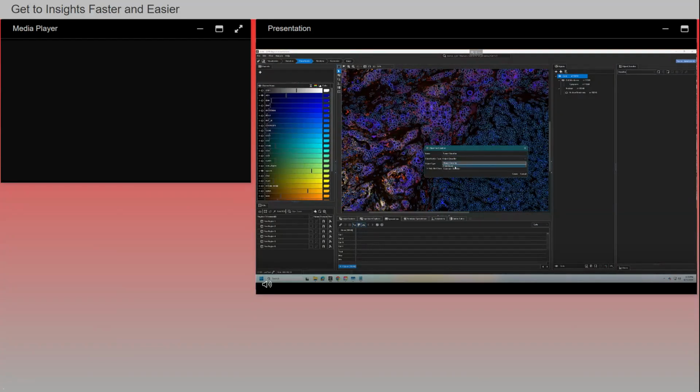And there are a number of different classifier steps that we have built in. The first two are supervised, and the last one is unsupervised automated method of clustering based on phenograph latent. I'm going to use supervised method, and of course if you want to see the difference, there's a difference here that goes into details to help you choose.